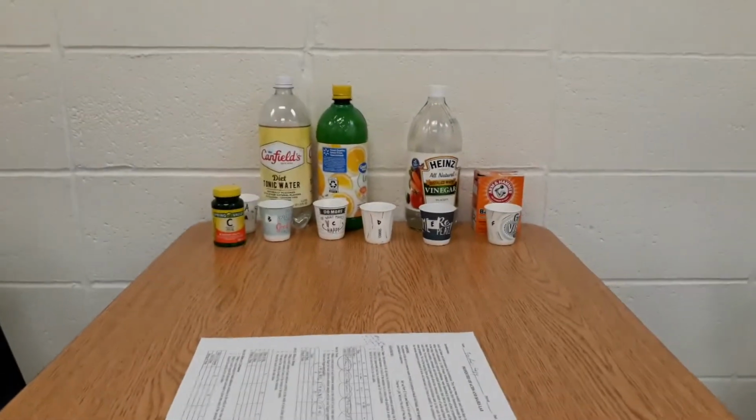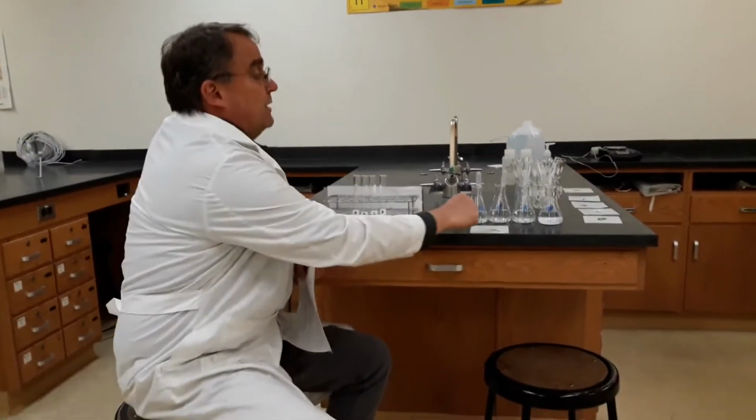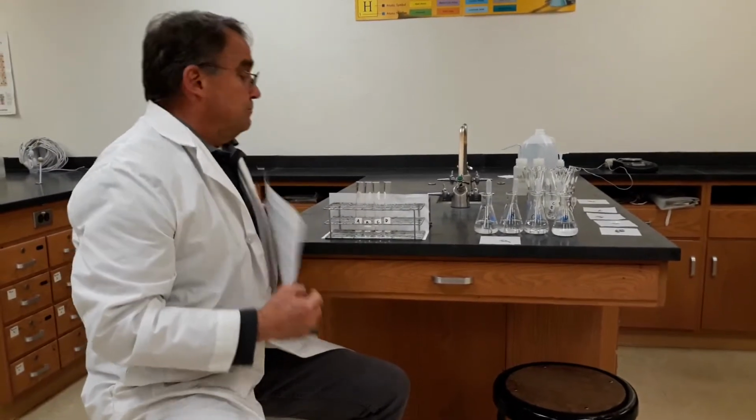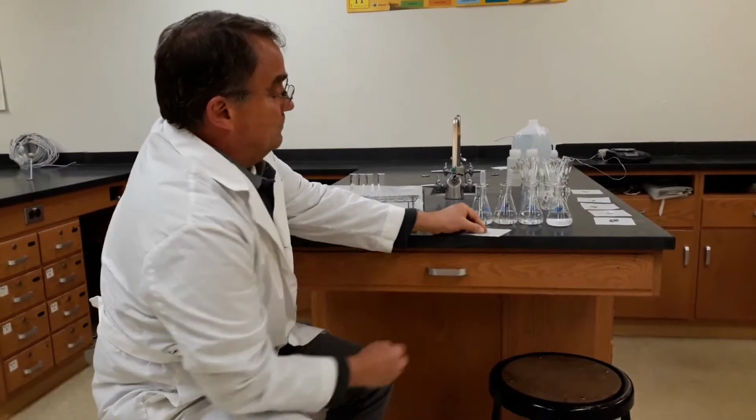There we have it. That's the taste portion. All right, for the remainder of the lab, we're going to be testing the properties of these four substances based on what they do with various metals, carbonates, and then organic compounds. So the first is the reaction with magnesium. You've seen it several times.